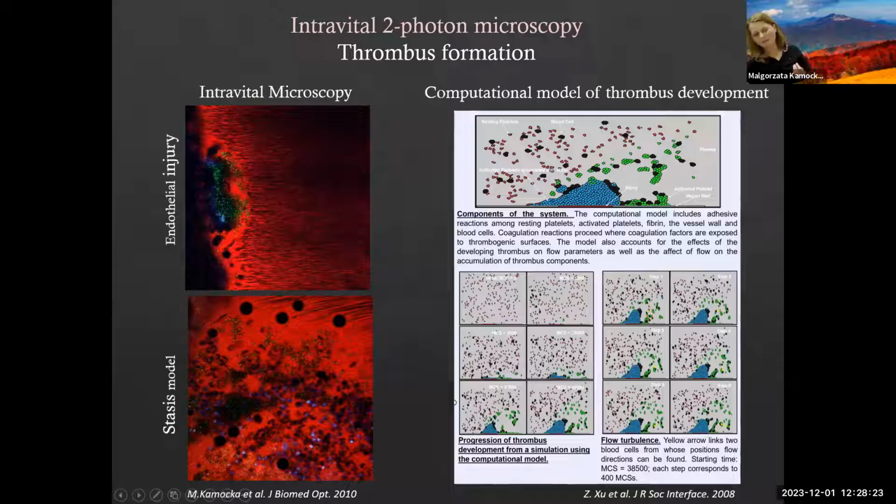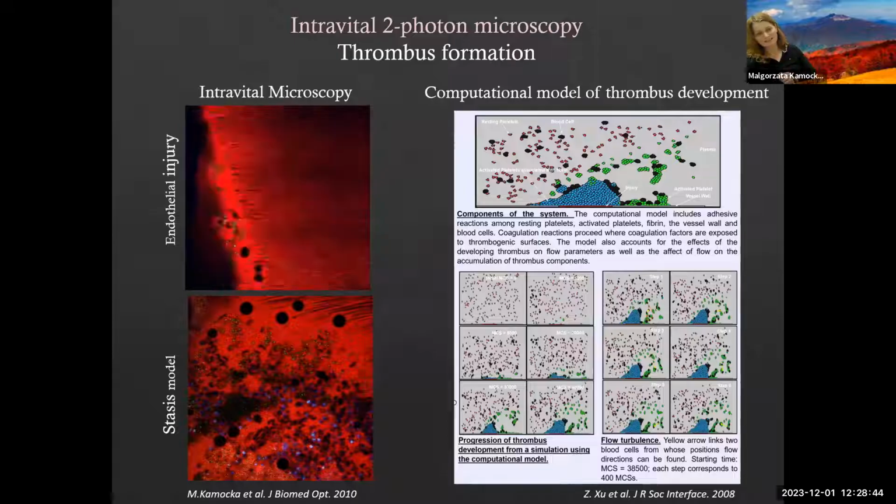So always think about image analysis not only in terms of looking at intensity. Don't close your possibilities. Don't make it very narrow, because sometimes you can expand it to something really very different, very useful, and even unexpected.